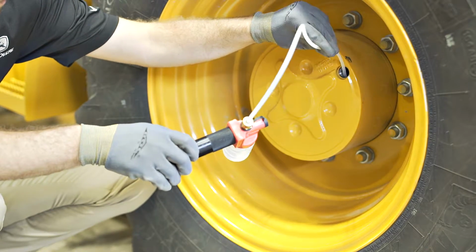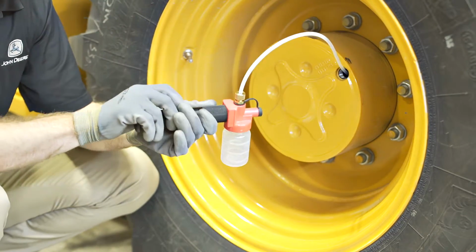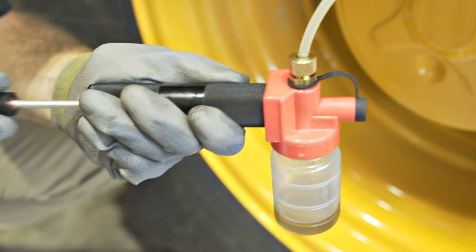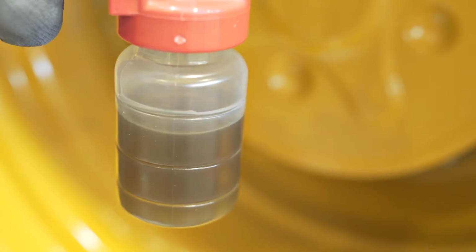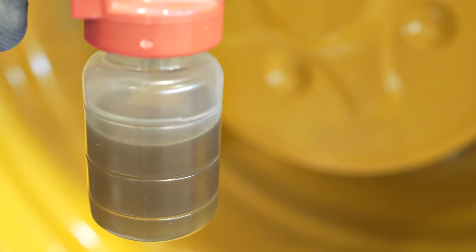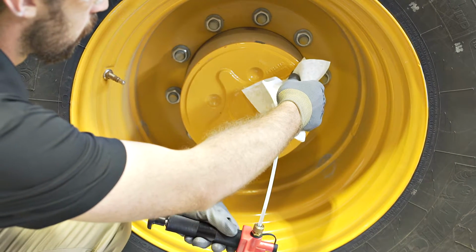Pump the vacuum pump handle to create a vacuum. Hold the pump upright to avoid oil from contaminating the pump. Fill the oil sample bottle approximately 80 to 90% full. Leave some airspace between the top of the fluid and the top of the bottle. Obtain samples during normal equipment operation or within 30 minutes after equipment is shut down. The sooner the better. Again, consistent practices are important.